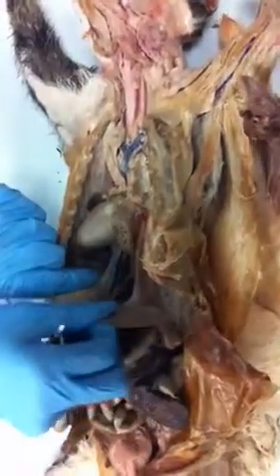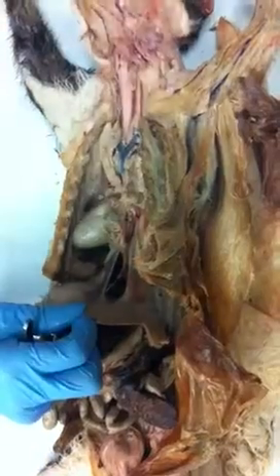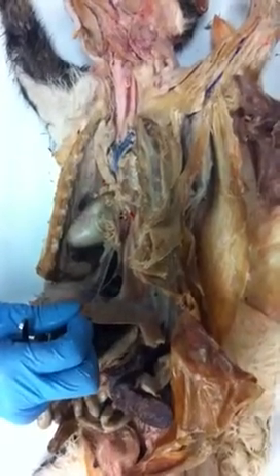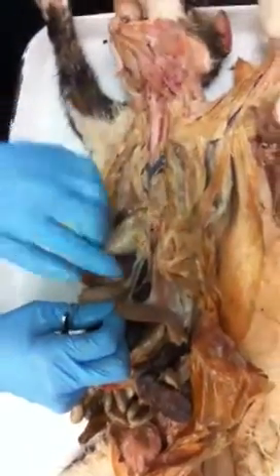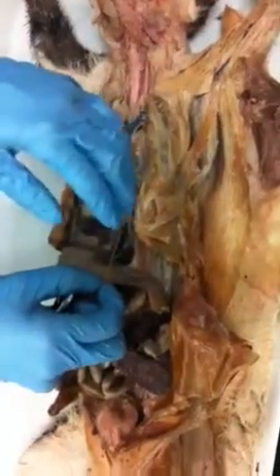Okay, that esophagus goes through the diaphragm at a specific point. There's one specific place where it goes through. That's called the hiatus. Okay, and in preemies, a lot of times that opening can tear and get larger. That's called a hiatal hernia, and that's when you can have abdominal contents pushing up into the chest cavity.